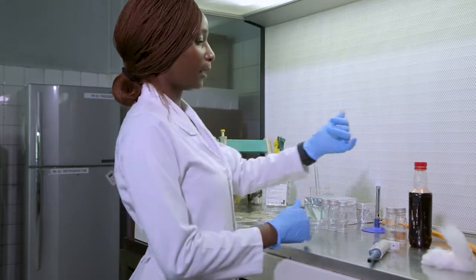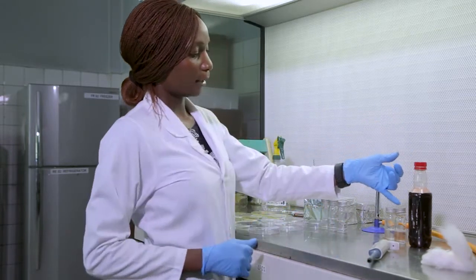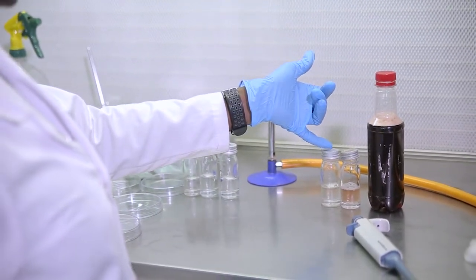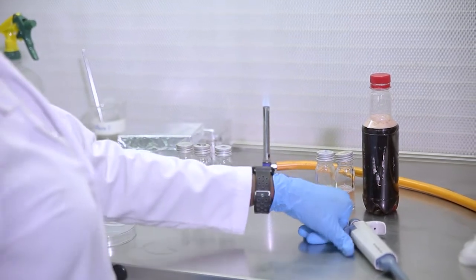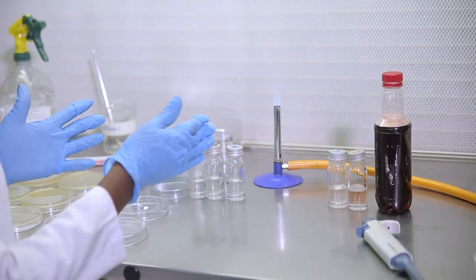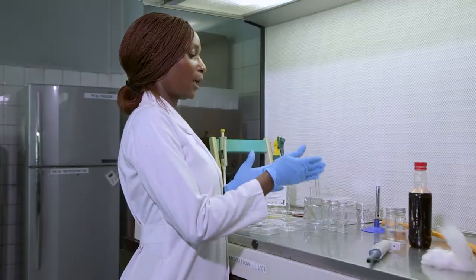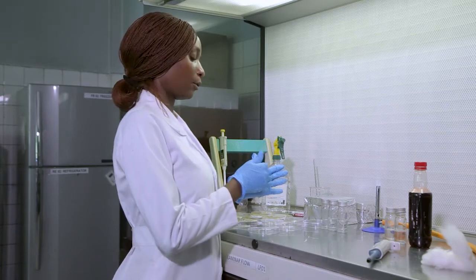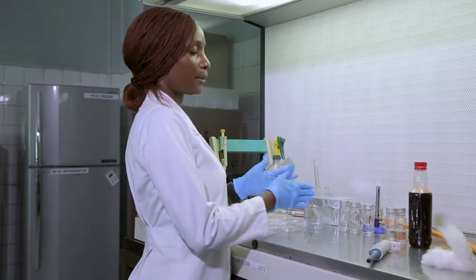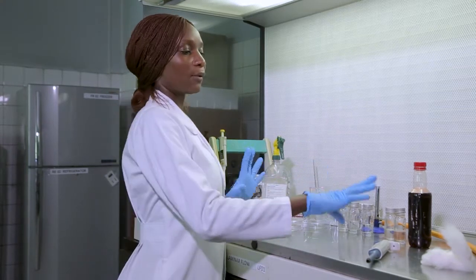Okay, so I have my 10 to the power 0 or the neat sample that has not been diluted. I have my 10 to the power -1 or 1 out of 10. I have 10 to the power -2. So here the sample has been diluted 10 times. Here the sample has been diluted 100 times. So if I continue diluting the sample, picking 1 ml and putting it in the next bottle, I'm going to have a serial dilution. The serial dilution can be done as far as 10 to the power -8, 10 to the power -9. It depends on the history of the sample.